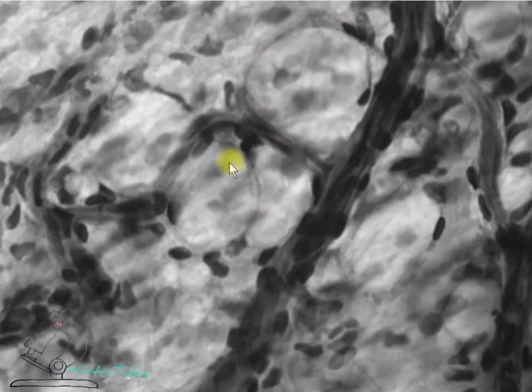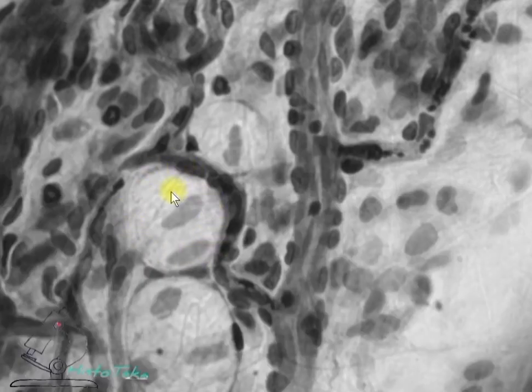Adipocytes, or fat cells, are large, rounded, the nucleus with organelles is displaced to the periphery, and there is a large drop of fat in the center that dissolves and is washed out during making of the preparation.